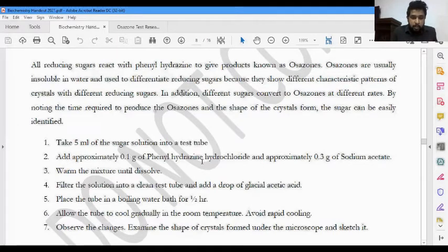So the osazone reaction takes place, as I mentioned, at the boiling point, which means 100 degrees Celsius, at 4.3 pH medium. How do we provide an exact pH medium? We need some mechanism for that. What is meant by a buffer?